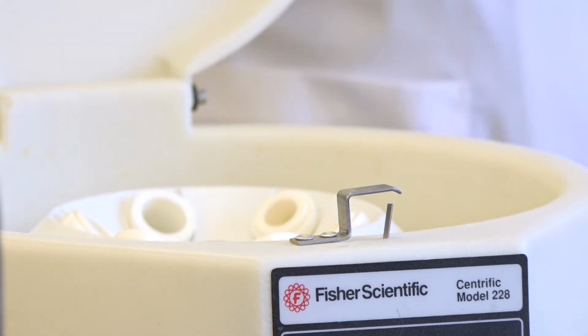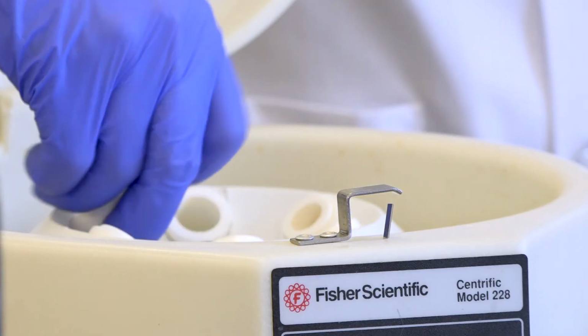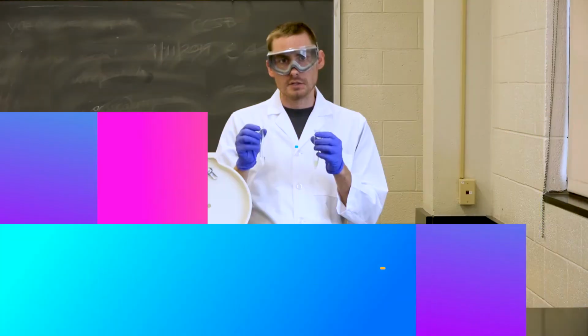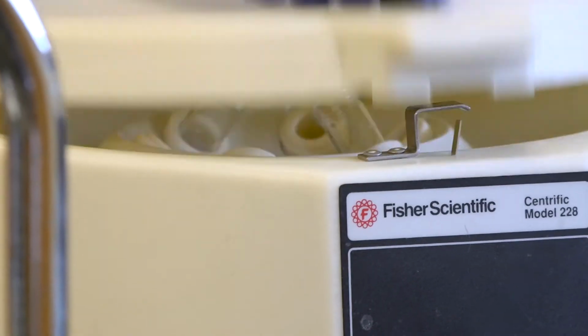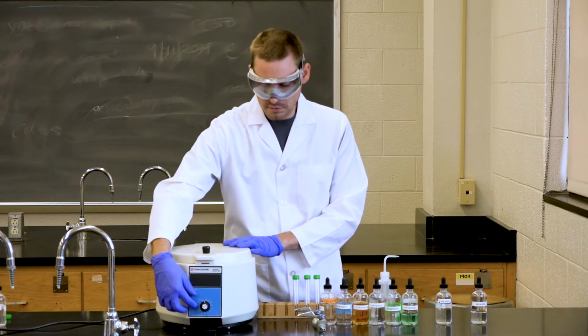So if we open the centrifuge, we will see that it has 6 tubes where we can add our samples. Some centrifuges might have these adapters that are smaller tube holders. You can remove them if you need to. So now we can place these opposite one another so that it's balanced. We can then close the lid and set the time for about a minute or 2.